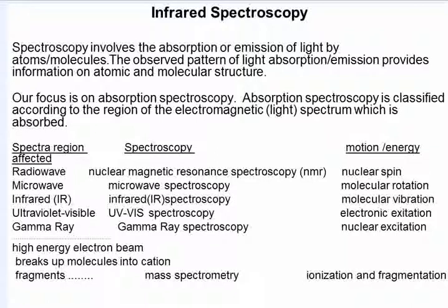Our focus in the laboratory will be on absorption spectroscopy. We're going to be studying a number of different absorption spectroscopies. First, IR spectroscopy, then nuclear magnetic resonance spectroscopy, or NMR spectroscopy, then ultraviolet visible, or UV-vis spectroscopy.